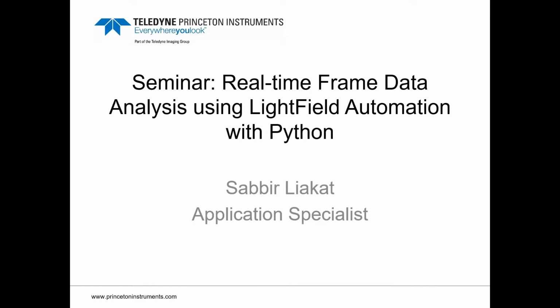Part of this series with Python automation, and we'll get into some real-time frame data analysis using LightField automation with Python. As a prerequisite for this seminar, it's best if you review the first two seminars, parts 1 and 2, because we're going to get into some advanced topics, and it would be great if you have a foundation that you can follow up on, because we're going to be getting into some pretty cool stuff with this one.